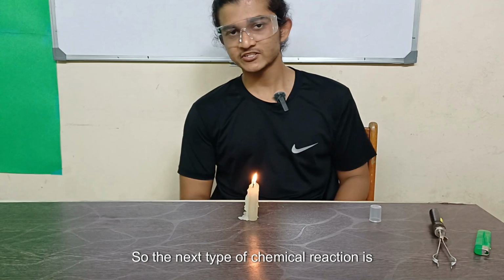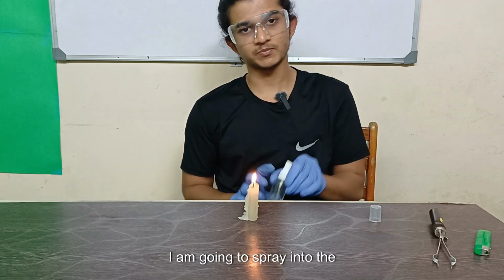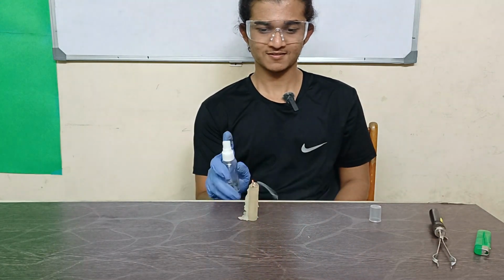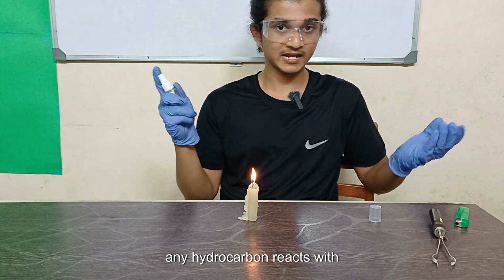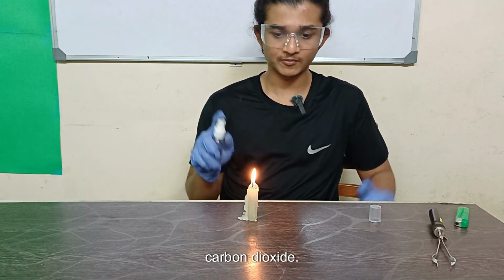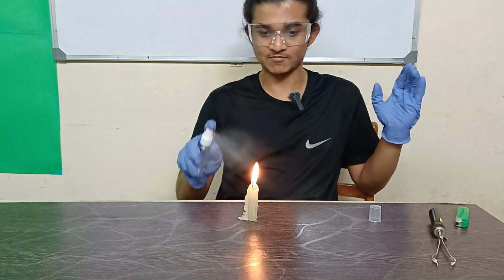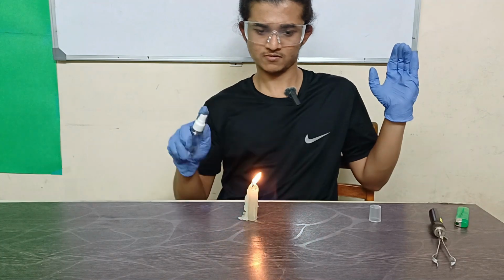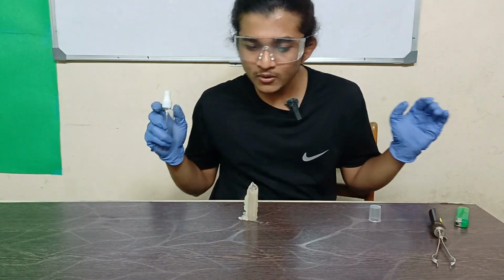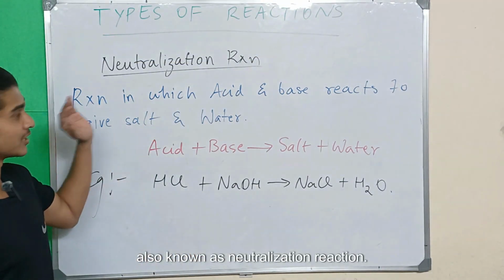So the next type of chemical reaction is combustion reaction. In this spray bottle, I have taken methanol, and I'm going to spray it into the flame here. So yeah, when any hydrocarbon reacts with oxygen, it produces water and carbon dioxide. So this is combustion reaction. Why is this so cool? Oh my god.